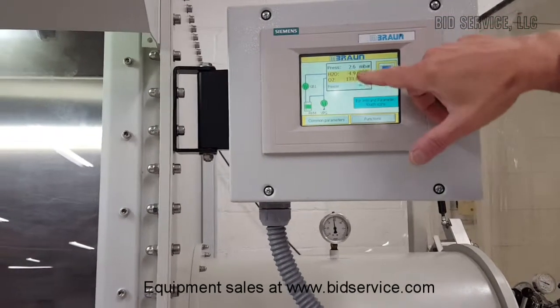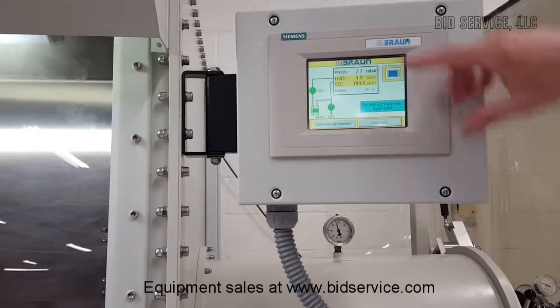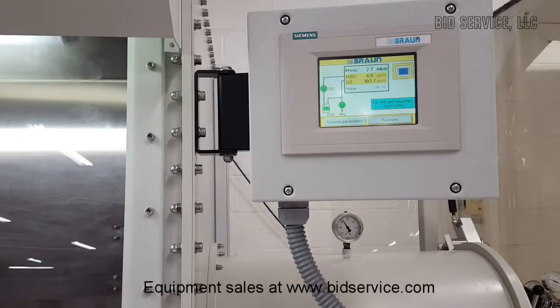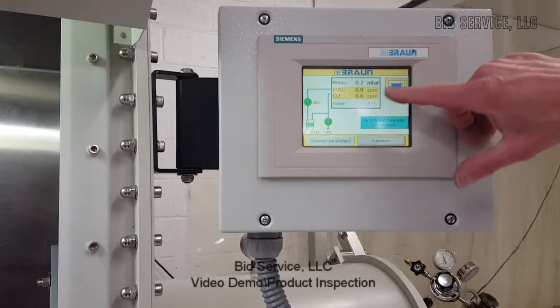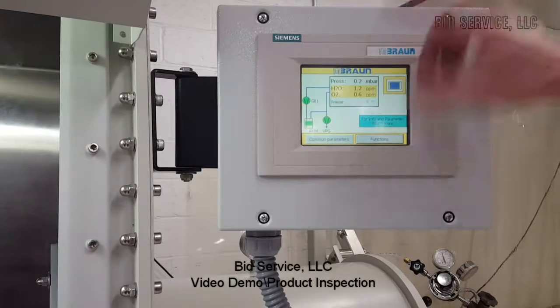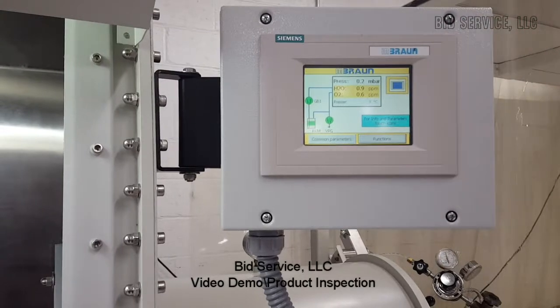We'll come back in a little while and we'll see that the oxygen cleans up. You can see the water vapors are dropping down now. The oxygen has now dropped down to 0.6 and the water is at 0.9 — they're on their way down.